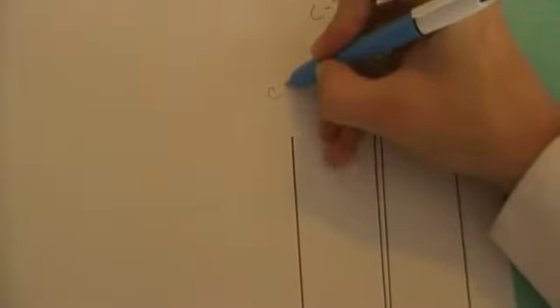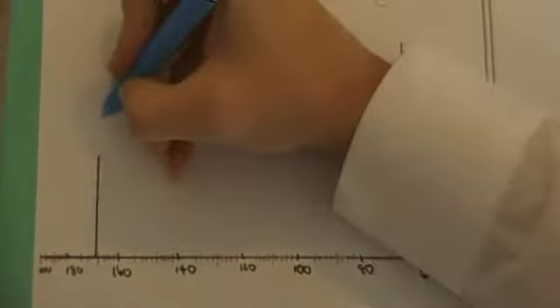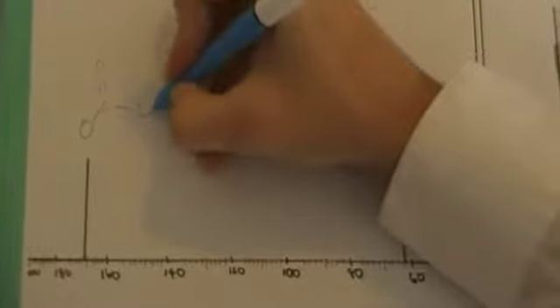This one, because it's more downfield, it's going to be attached to the chlorine because chlorine is more electronegative than this oxygen. So it is a C-Z bond as well. This bond here is going to be our carbonyl group, which is double bonded to oxygen. We have the other oxygen here, which is going to be there, and a carbon. As we look down at the proton NMR, this will not show up on the proton NMR because there are no protons. So we're going to go ahead and draw that out here, have the oxygen here.